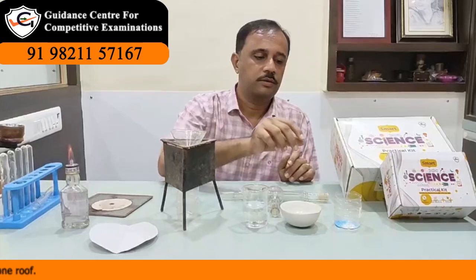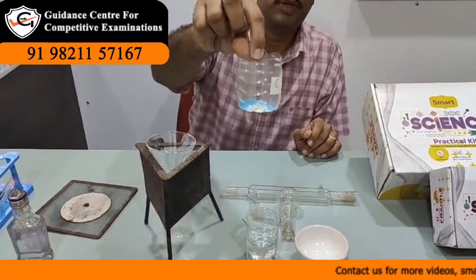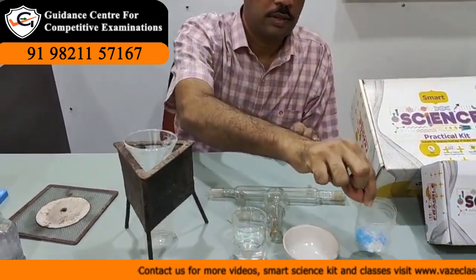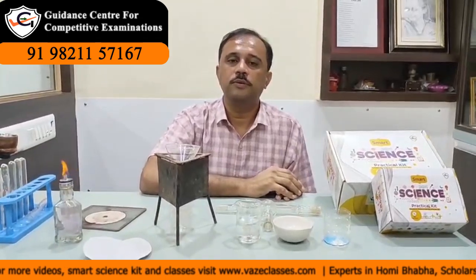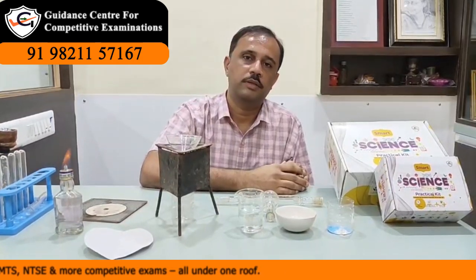Let us start. Today we have a mixture of calcium carbonate and copper sulfate in this bowl. We have to separate the components. We know that copper sulfate is a water soluble compound whereas calcium carbonate is insoluble in water. So we will make use of the filtration evaporation method.